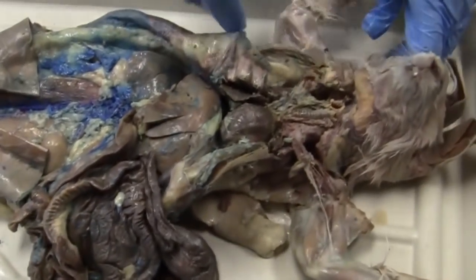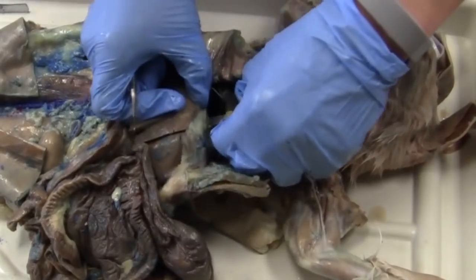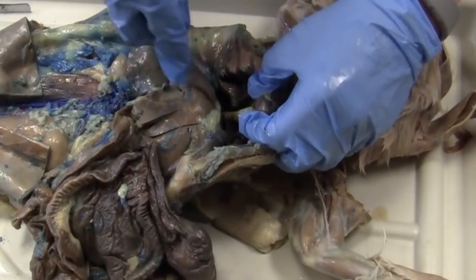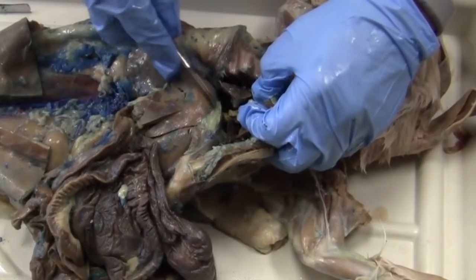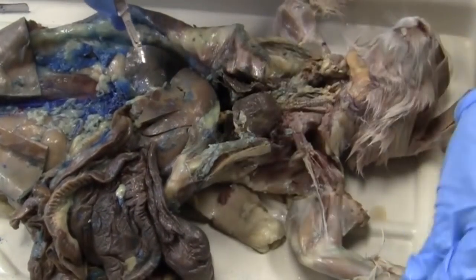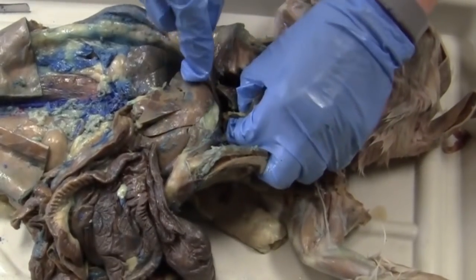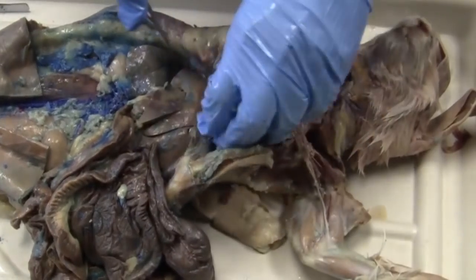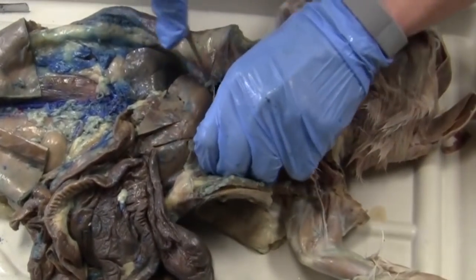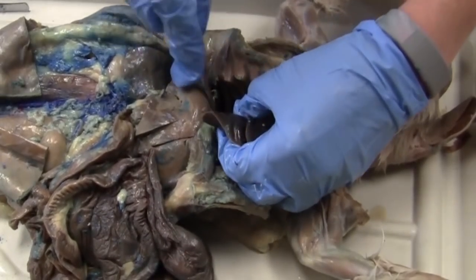So lastly, we are going to cut out your heart. So I want to go as distal as I can on the heart, and I can see the caudal vena cava, and I actually just want to cut. Preferably cut out both the heart and the lungs.